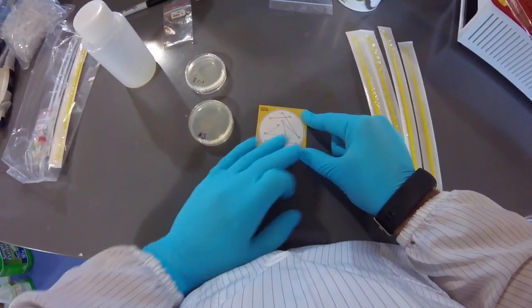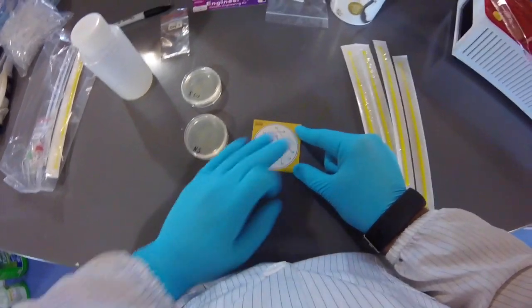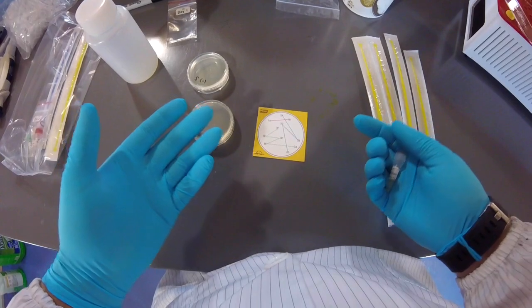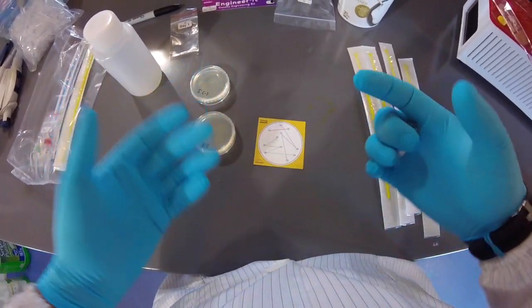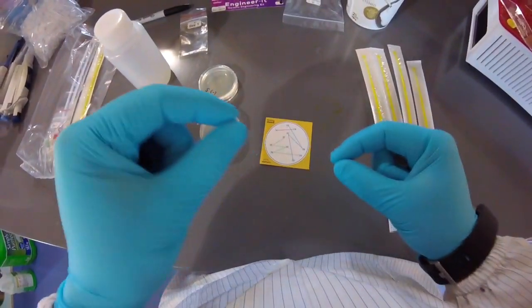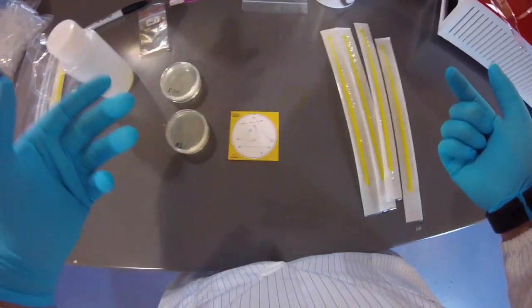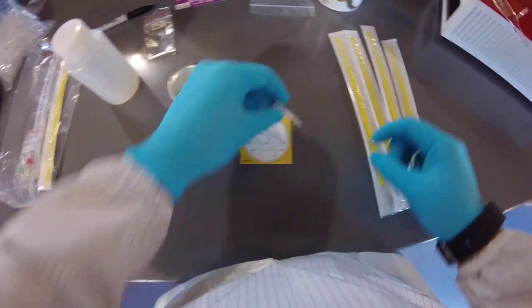So you get less and less cells spread out over the Petri dish, and then as they grow, that single bacterium will grow and divide into thousands and thousands that will form these little mounds we call colonies, okay? And then we'll be collecting those on day 2 for engineering, okay?